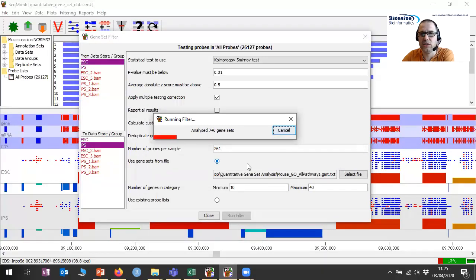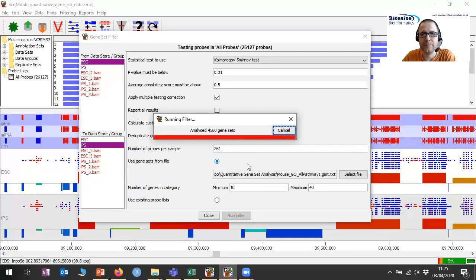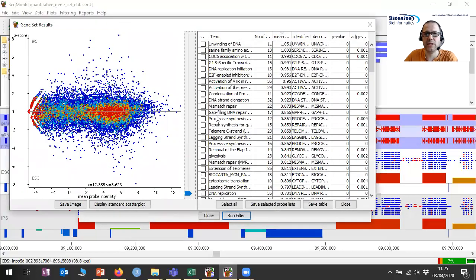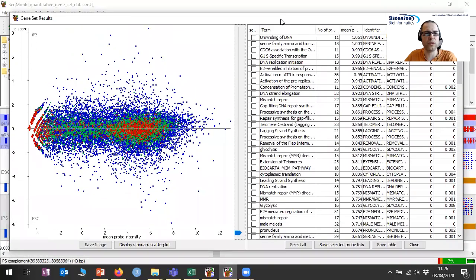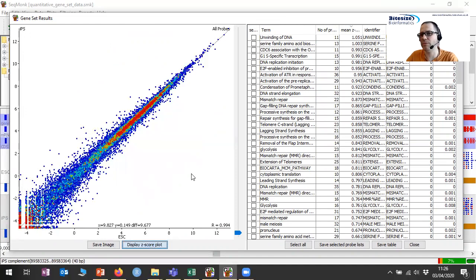It's going to step its way through the gene sets, running the tests on all of those, and then bring up a visual representation of the data so we can review them. We have two ways to look at the data. On the left-hand side, we have a scatter plot of our comparison. We tested ESC versus IPS, and we can look at this either as a standard scatter plot — ESC versus IPS — or we can look at the normalized values, which were what we actually put into the test.